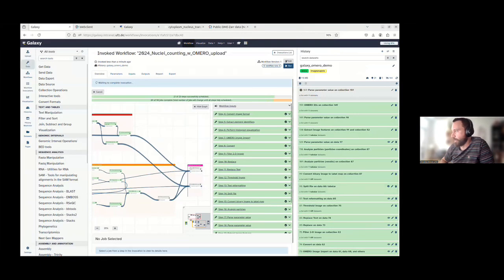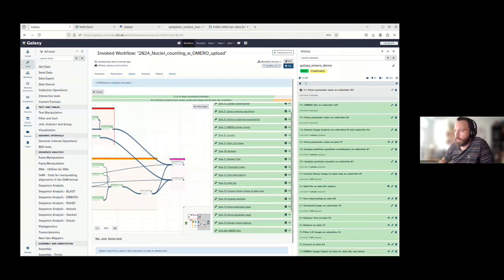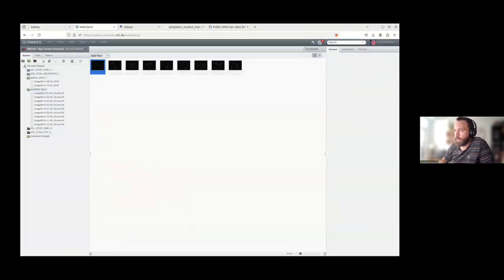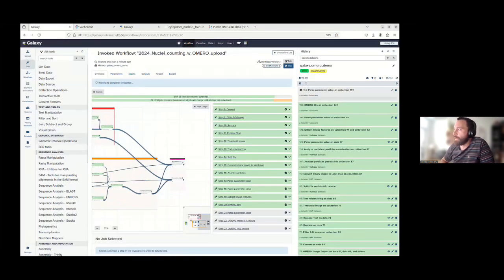We can just play around with it, and we can do it with any of these images that have worked. Back on the workflow, we are in the last step. Everything was uploaded, the image processing analysis was performed, and the only thing to do now is to upload the metadata and the results that we produced during the analysis. You can see the image here.